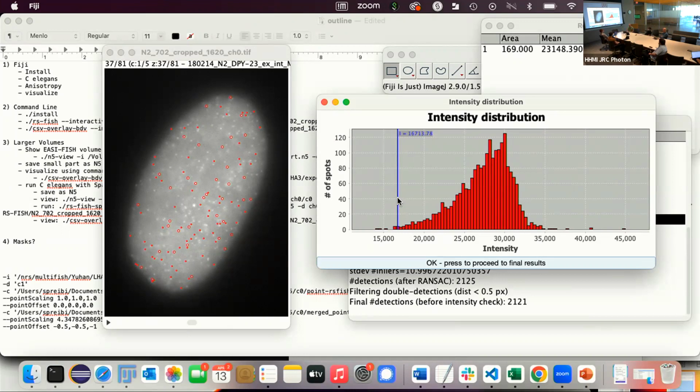Because we're trying to support other standards so that you can easily go to other software, like Michael here wants to write a data export, instead of just CSVs and stuff like that, so that we are more compatible with the tools that are out there. Because there's still some normalization, standardization missing. For all these tools, everybody writes something else.